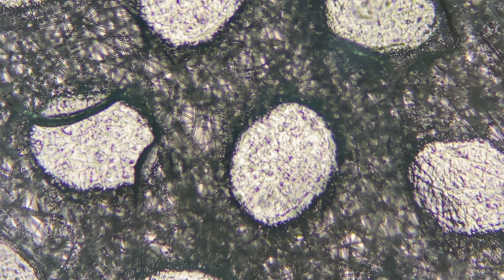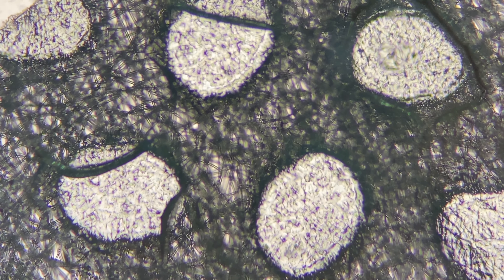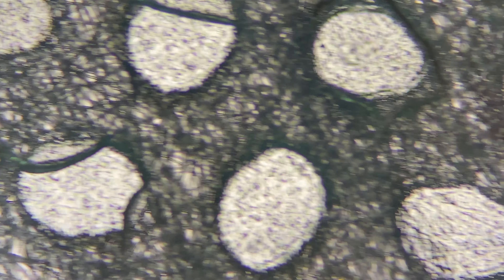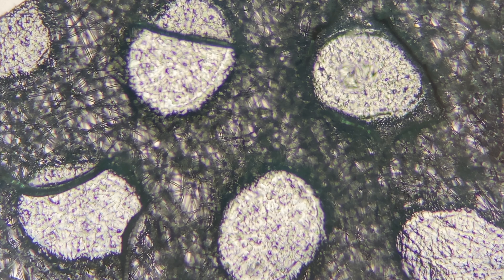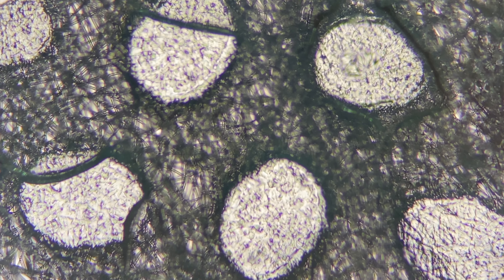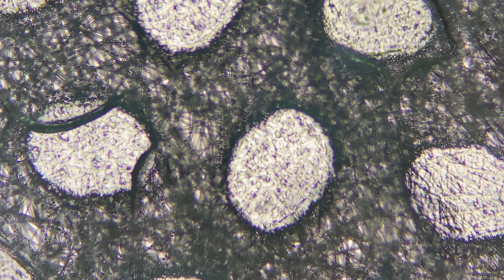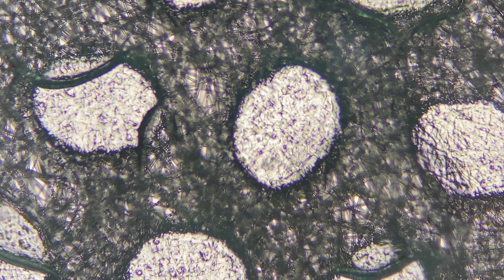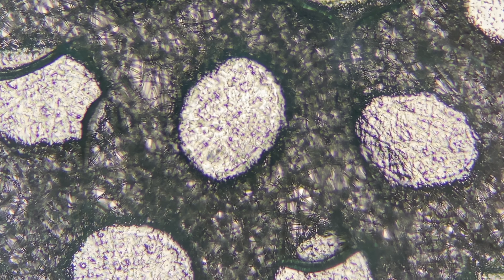This is the blue layer of the mask that you usually see, which is to say the most outer layer of the mask. It is made out of non-woven polypropylene and its purpose is to protect the inner layer of the mask. As you can see, the fibers are quite coarse and there are a lot of them, but they are not really stuck together that well and you can easily see through them.